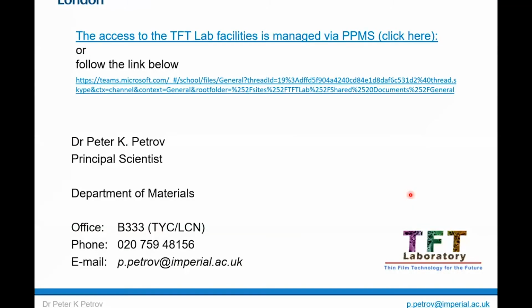The access to all our equipment is via PPMS. So I believe all this presentation will be available, with a clickable link to the instructions on how to get enrolled to the TFT lab user list, or if this link doesn't work, there is a link which you copy and paste. But if you wish, always email or call me. I'll always be happy to help.